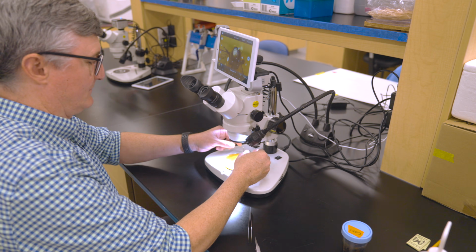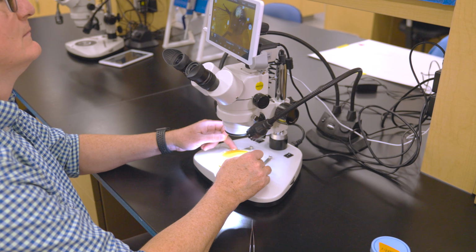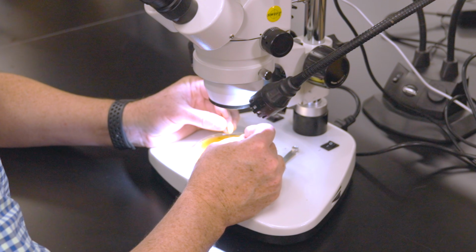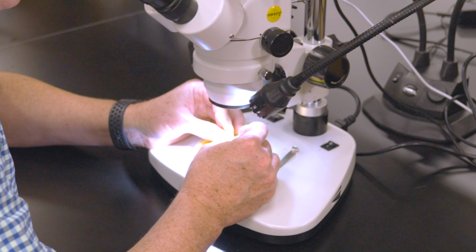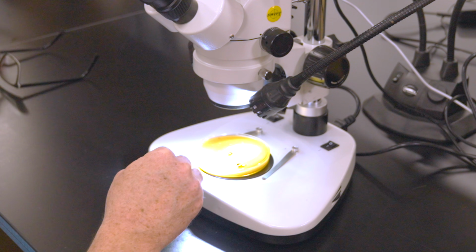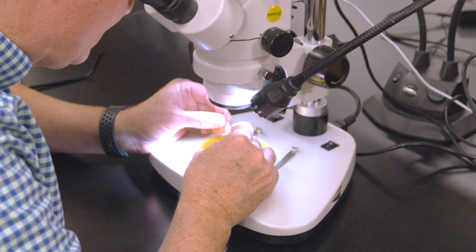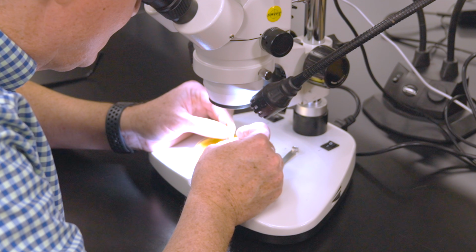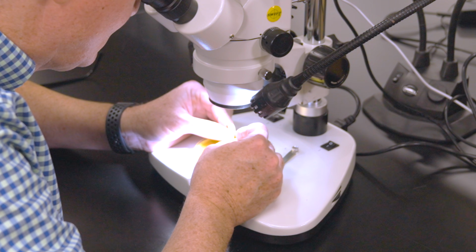Now I will take a pair of forceps and place that bee's thorax into a petri dish on the beeswax. The petri dish I've already flooded with ethanol. So I'm not doing a dry dissection. The petri dish is flooded with ethanol or isopropyl alcohol so that when I put that thorax onto it, it is submerged completely under the liquid. It makes it easier to see things when you are working with that bee.